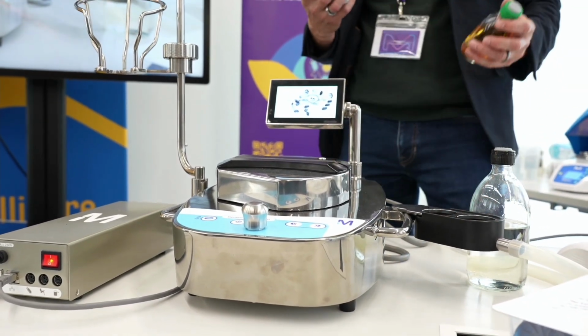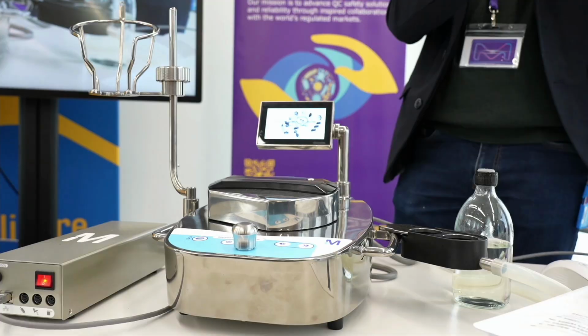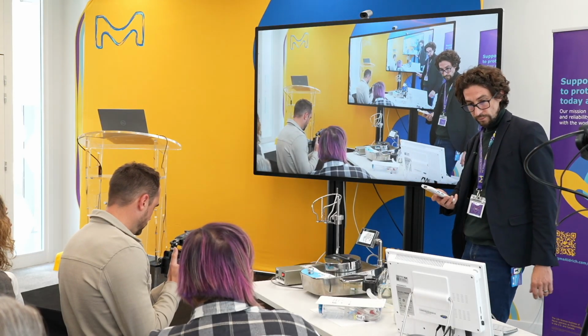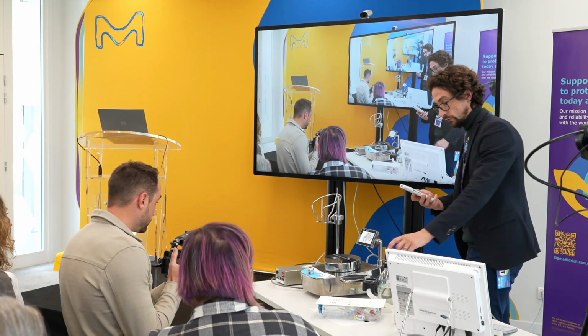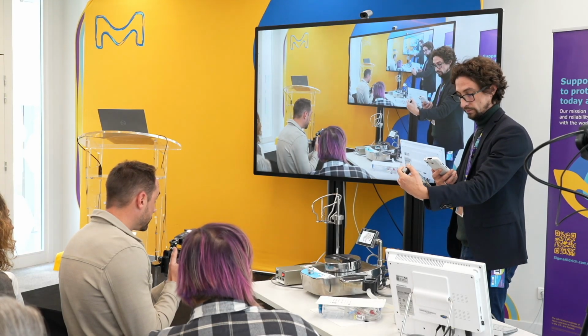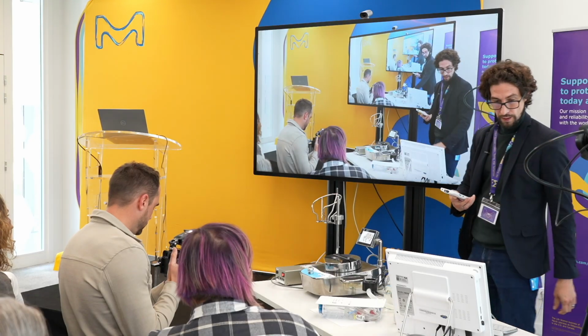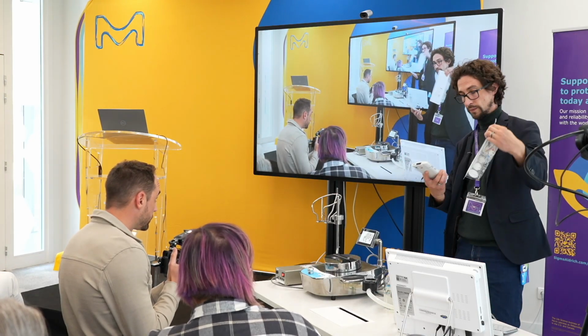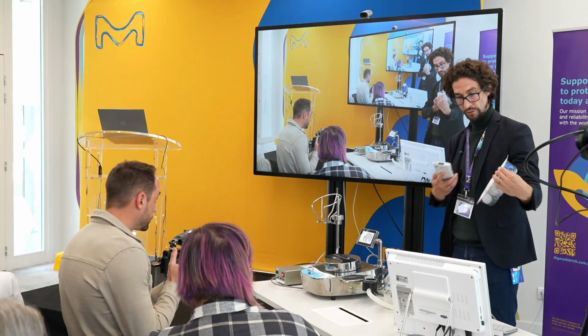Then I need to scan a TSB bottle. Then I need to scan a fluid A bottle. And a sterility test device for the execution.